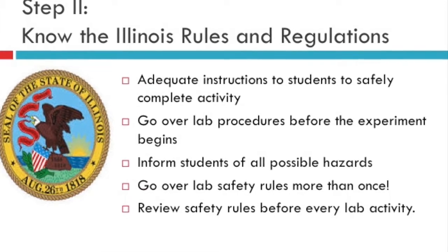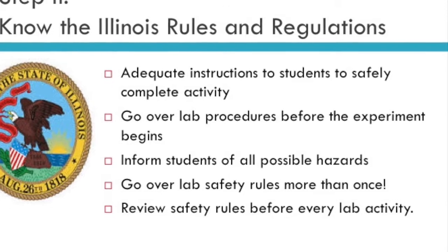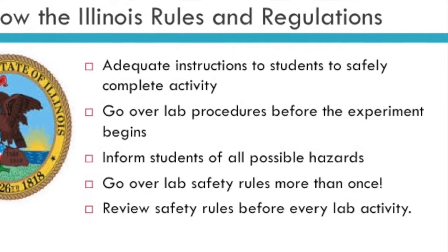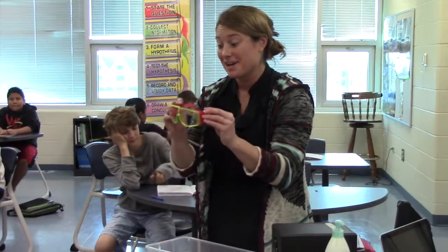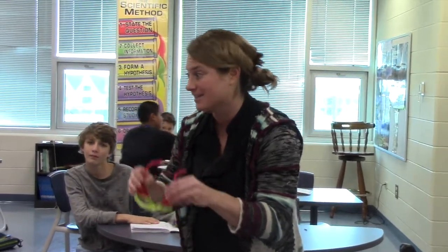Provide adequate instructions to students to safely complete the activity. Go over lab procedures before the experiment begins. Inform students of all possible hazards. Go over lab safety rules more than once, and review safety rules before every lab activity.